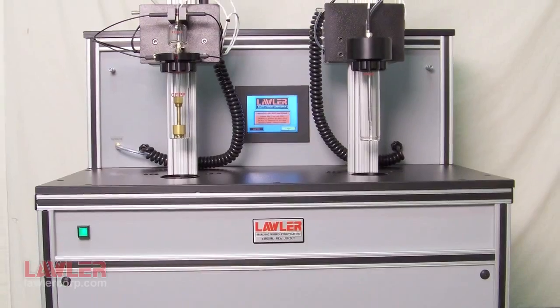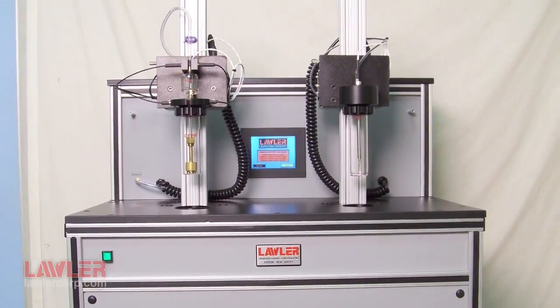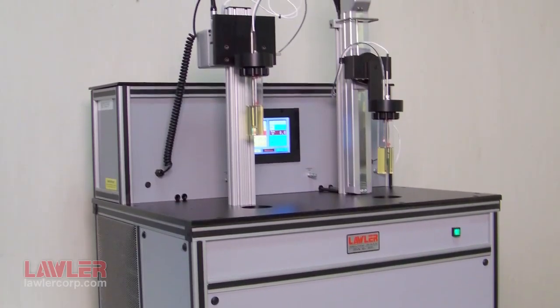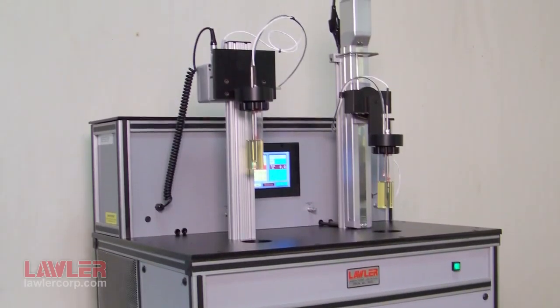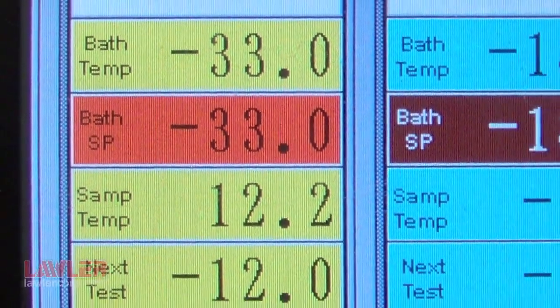In summary, the Lawler Directly Refrigerated Automated Cold Flow Properties analyzers have a common foundation of well-built refrigeration, robust control, easy-to-use color touch panels, and test method heads designed to mimic the manual test methods and allow visual verification of results.